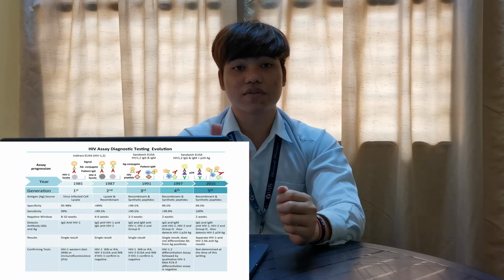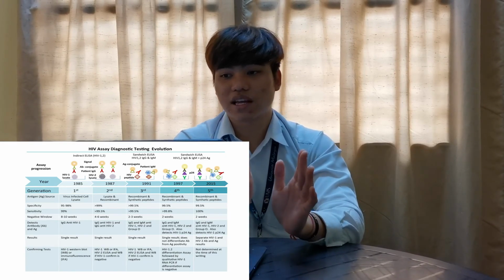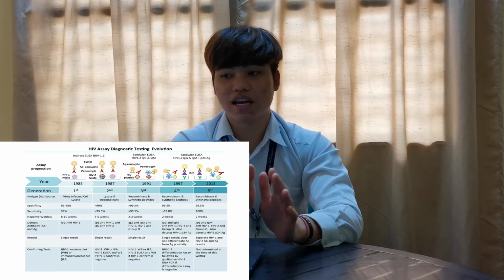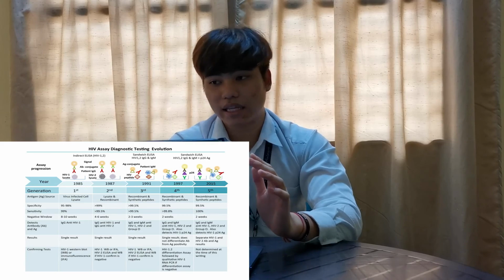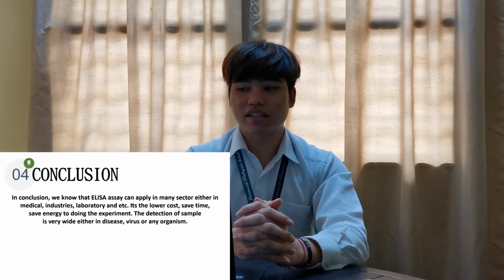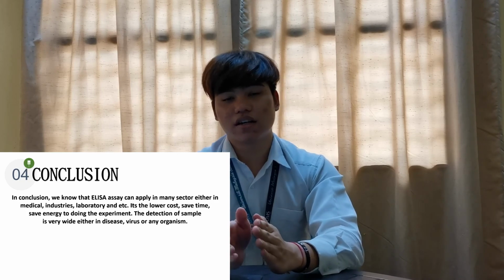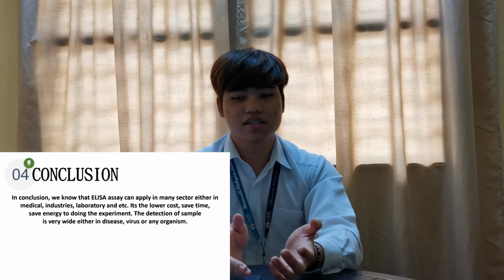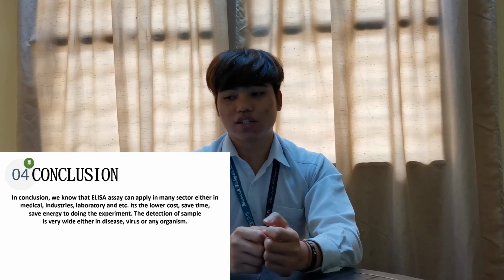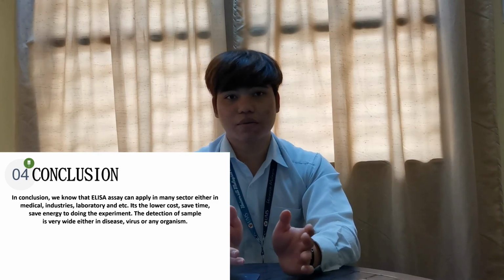There are 5 generations, from using the indirect ELISA until the sandwich ELISA, and the last one is also the sandwich ELISA, but plus some antigen or antibody related to these samples. In conclusion, we know that ELISA assay can be applied in many sectors, whether medical, industry, laboratory, or medicines. The cost is much cheaper than other experiments. It saves time and energy in doing this experiment. The detection of samples is very wide, whether disease, virus, or any organism related to the antigen and antibody.